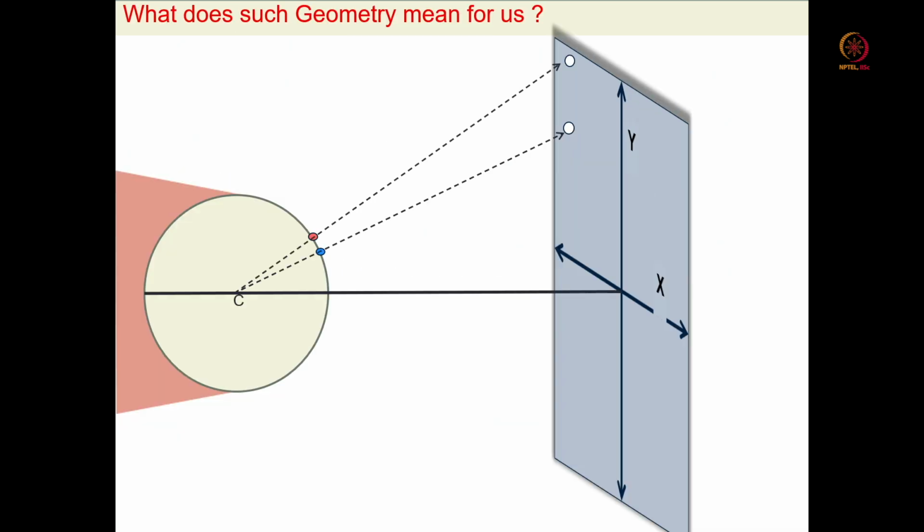In the last class we also talked about the reverse point projection model. Here, I told you that any atom present on the surface at the near field will usually field evaporate perpendicular to the surface, and as it moves away from the near surface, it gets compressed towards the axis of the specimen.